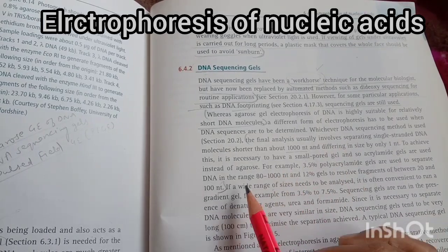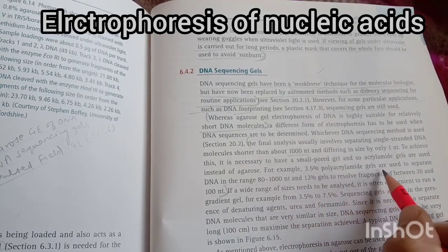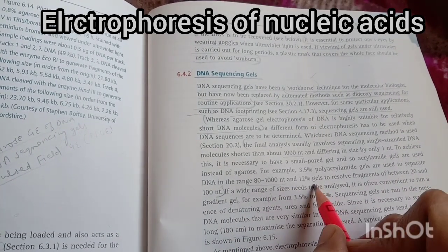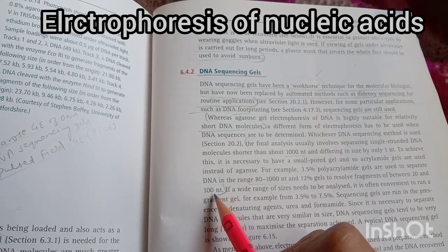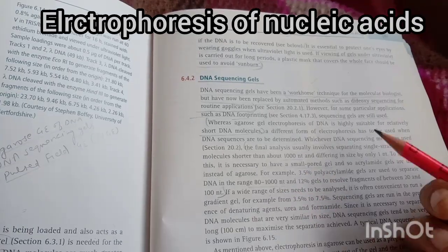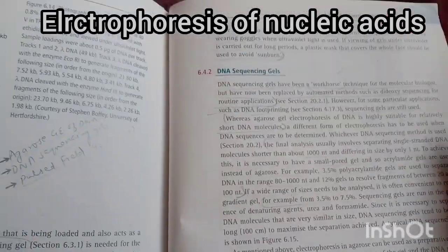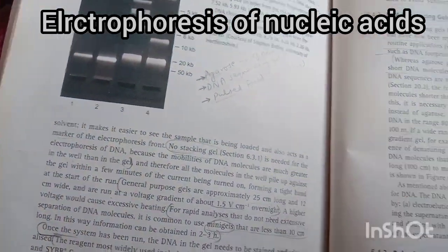For example, 3.5% polyacrylamide gels are used to separate the DNA, and 12% gels to resolve fragments between 20 and 100 nt. So these are some examples of how we can use this for the separation of small pore size DNA. This is not as important in comparison to agarose gel.